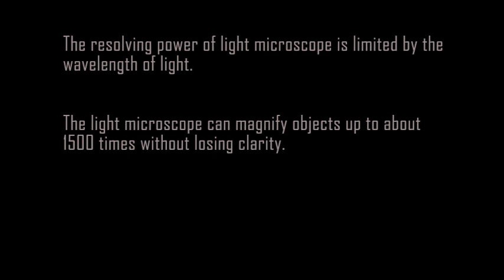The light microscope can magnify objects up to about 1,500 times without losing clarity.